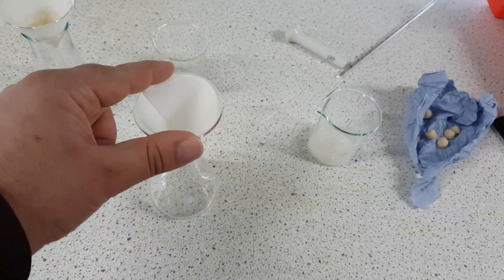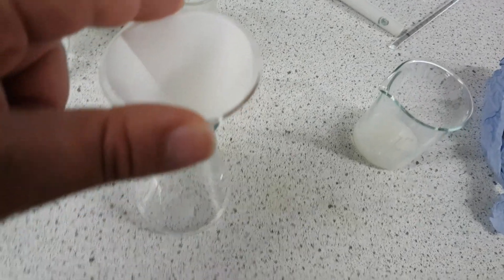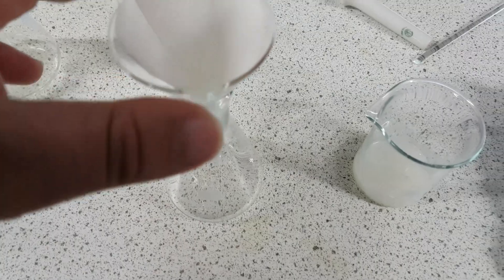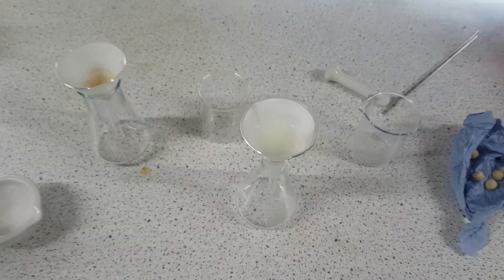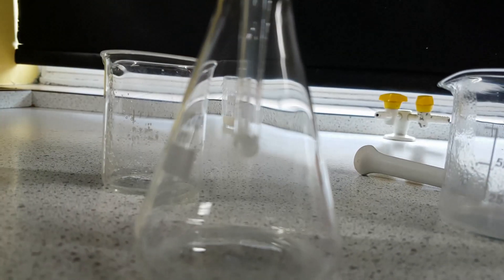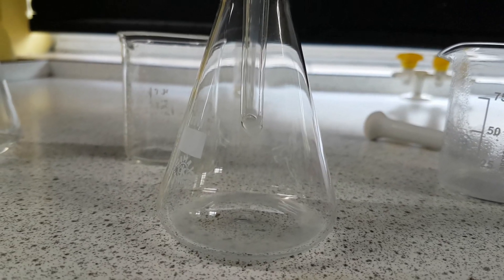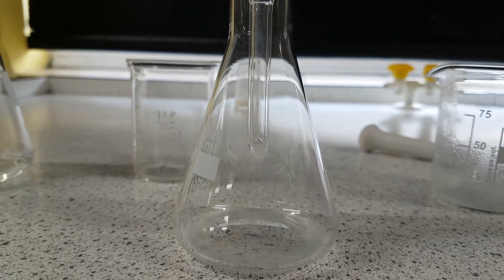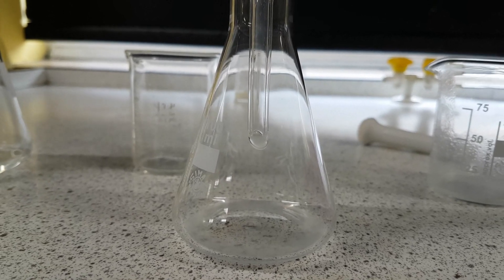Again it's the same procedure — funnel on top, filter paper, and just filter it through. I'm going to take my new solution of dried milk powder and place it into my new conical flask. Once you pour a bit of the solution on, the filter paper will remain in place. What you're going to have is the residue once again staying on top and the filtrate of the solution coming through — so it's coming through bit by bit.